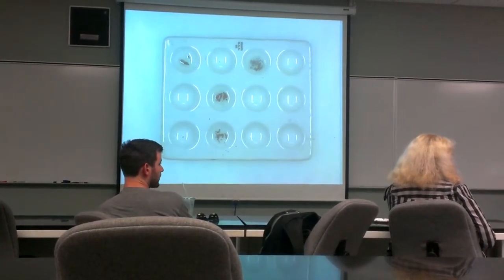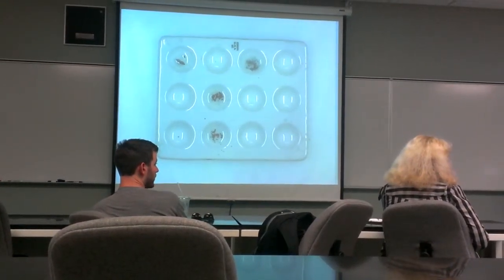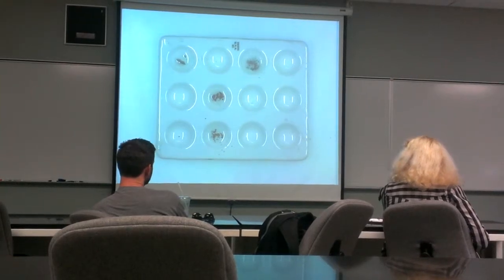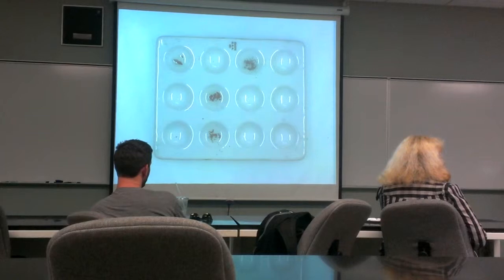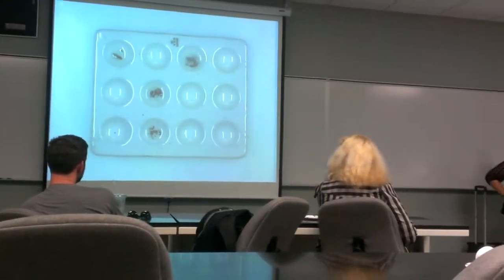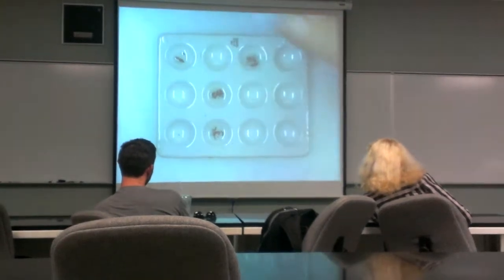Sorry. No. Then this is the key to the pregnancy test. Literally, if there's nickel in it, it turns pink. If it's not, it doesn't. Yes. It's the pregnancy test for meteorites. Yes, if it turns pink, chemically, it's a meteorite. It's called dimethylglyoxime. So let's see if it's working.